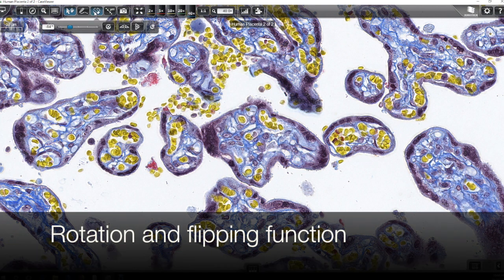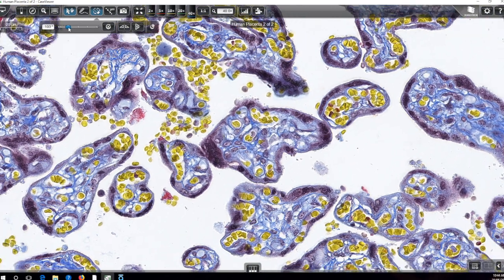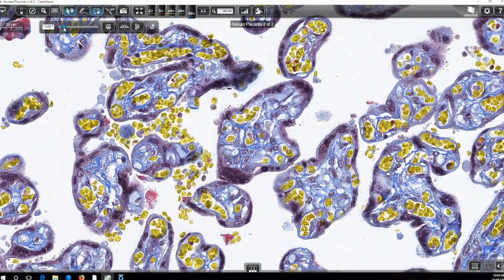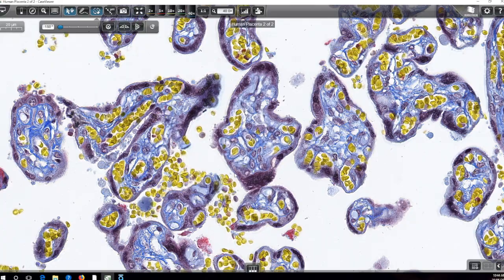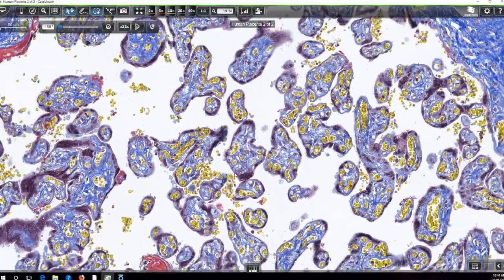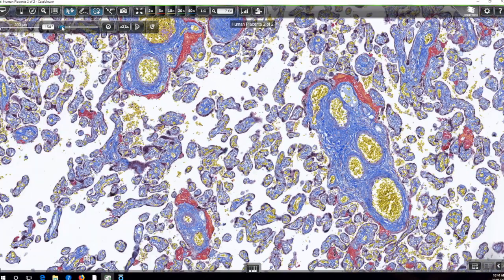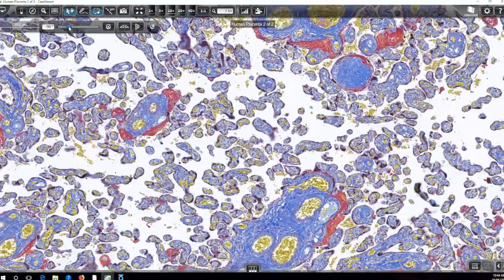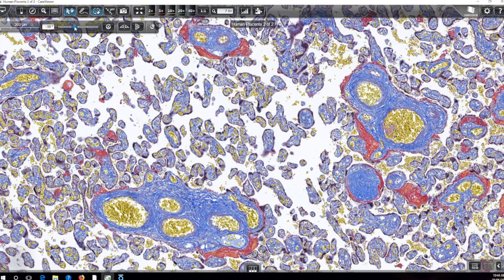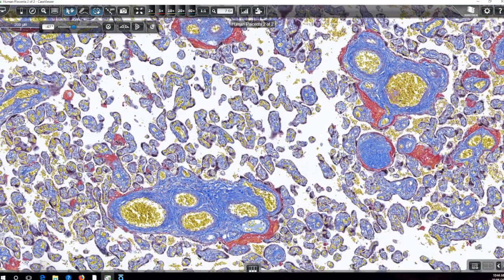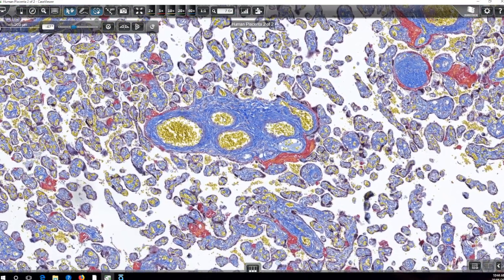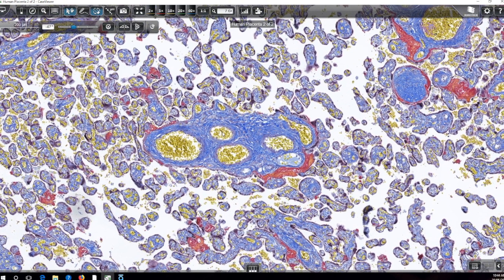Sometimes as you may be aware, when you've got a mounted slide, it may not always be in the right orientation that's convenient for taking a particular picture. So of course, you can do this to some extent on an actual microscope, but here on the virtual microscope, you've got the ability to rotate pretty much to any angle that you would like. And so it's a really useful way of framing areas of interest.